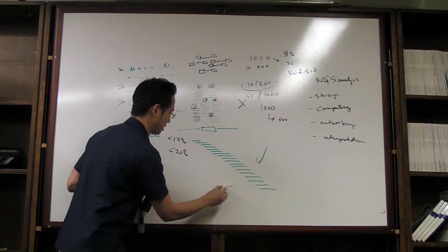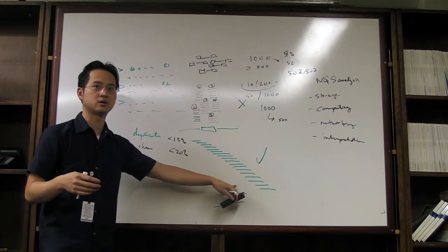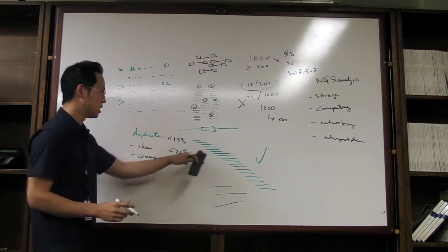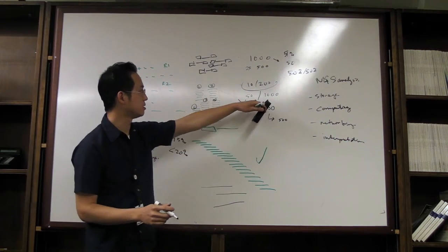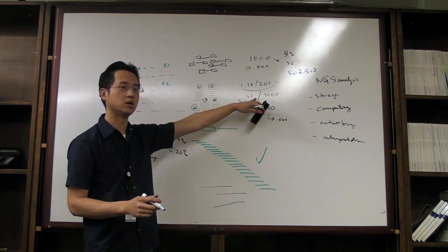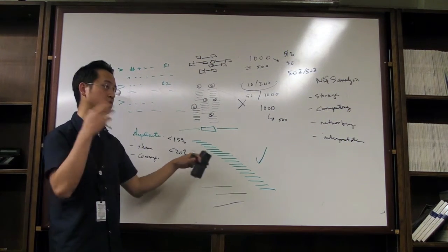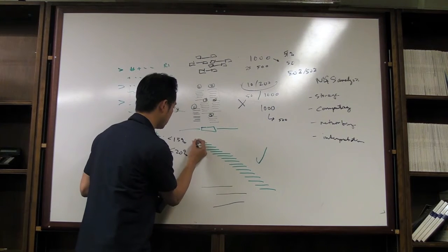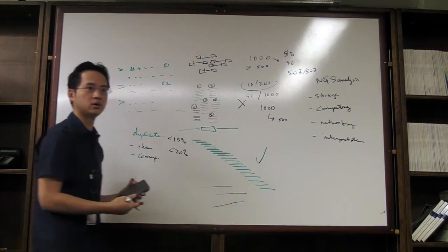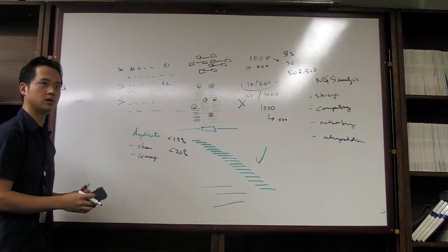Because if you only shear in bulk kinds of ways, it doesn't allow you enough chance to create random start sites. It's a factor of shearing. It's a factor of coverage. So if you sequence high enough, right, the duplication rate will increase. You will be able to show that there's a high duplication rate here. So if you sequence to 34x coverage, you can probably get a very complex library. That same library, if you sequence to 1,000x coverage, then you start getting duplicates of each one of these as well. So it just depends on the sequencing level as well. And I don't have any magic formula for this, but that's the way it is.